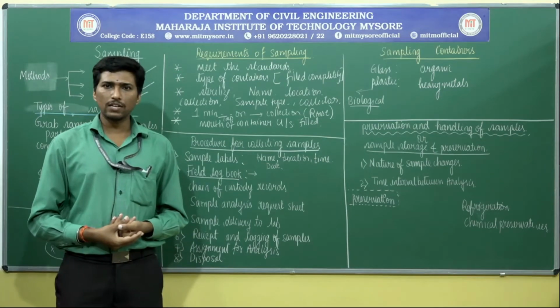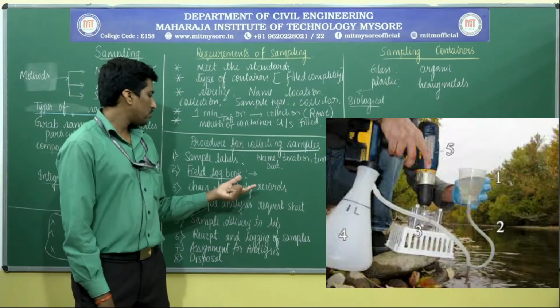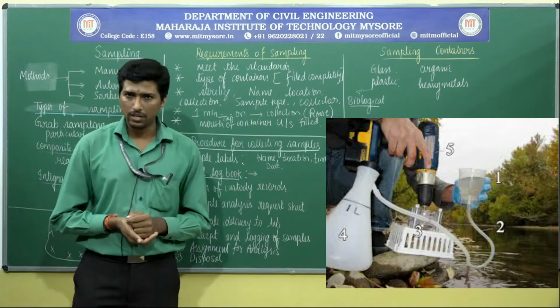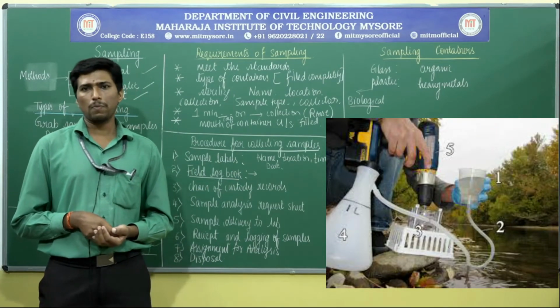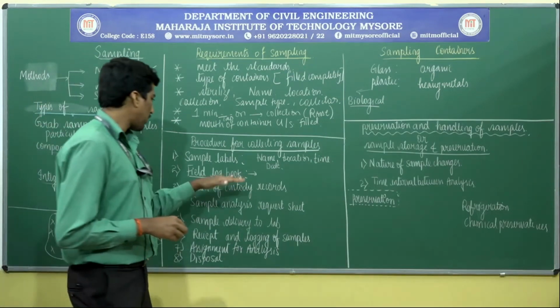In addition, you must record which kind of analysis the sample is for, whether physical, chemical, or microbiological. That is one major thing you have to note.